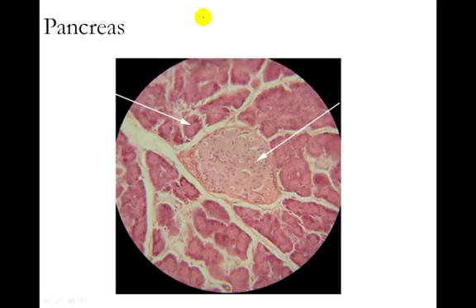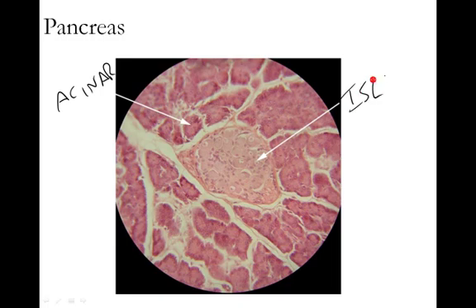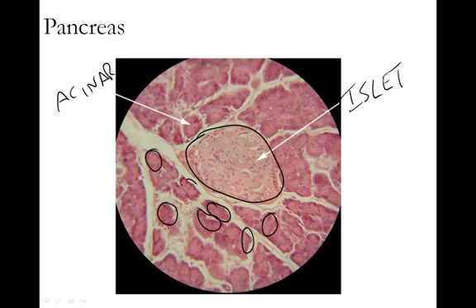Here's another image of the pancreas taken directly from one of our microscope slides in the lab. In this image, you can see very clearly that there are acinar cells and there are islet cells. This is the pancreatic islet right here — you can see how much different that bundle of cells is than all of these bundles of acinar cells, which secrete the enzymes for digestion. Make sure that you can identify an islet versus an acinar cell. You won't be asked to identify specific alpha, beta, delta, or F cells, but know the islet from the acinar.